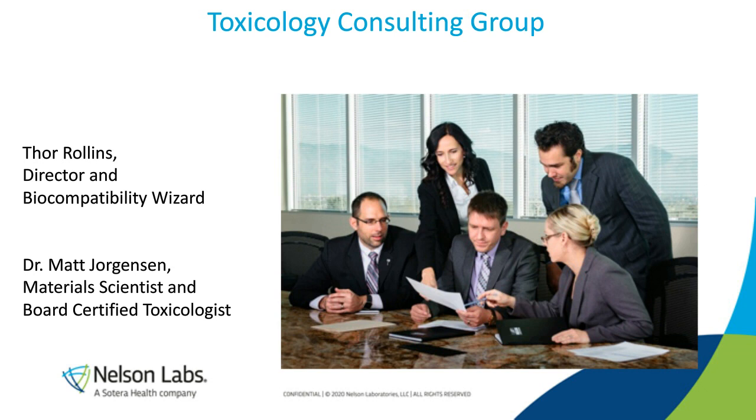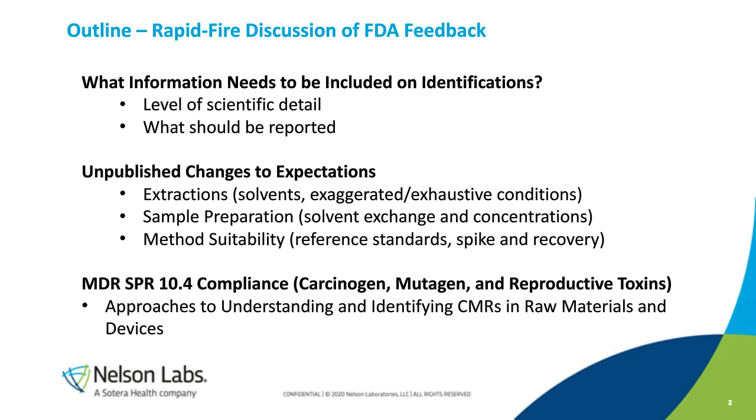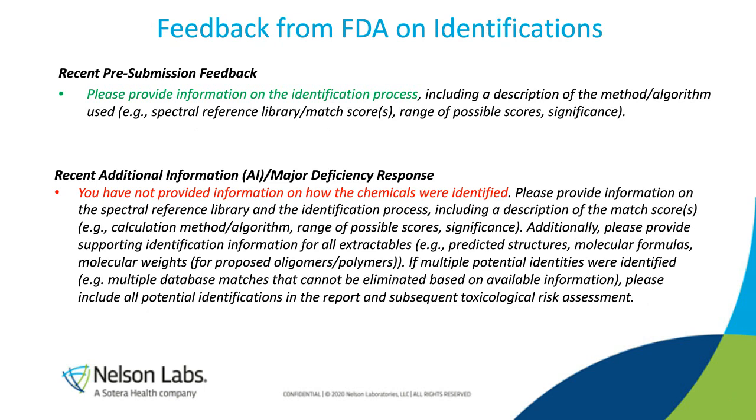So with that, I'll just go through. Basically, this is a rapid-fire discussion of stuff that we've heard over and over from the FDA, with a little bit more emphasis on identification and quantification issues, including things about reporting. One of the things that I wanted to start with here, so you can see, I'm showing feedback that we've received both in pre-subs and as part of additional information requests or major deficiency response requests.